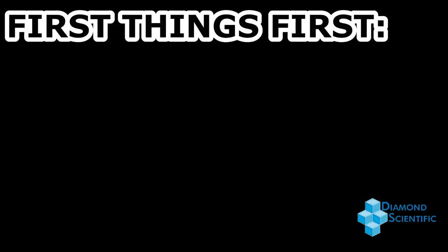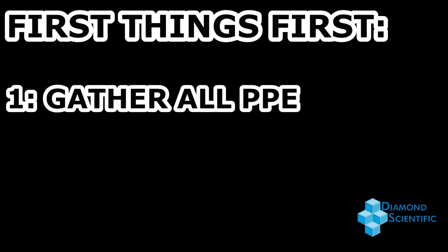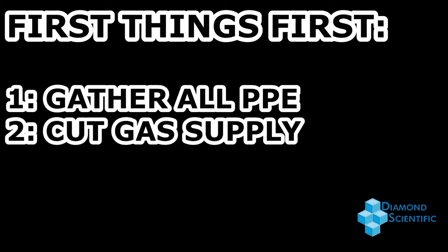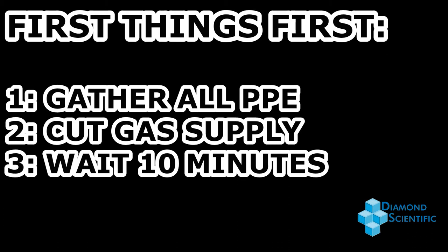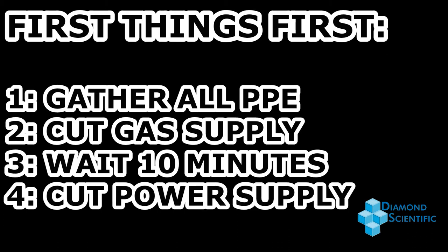First, whenever performing maintenance on the SWG-100, gather all appropriate personal protective equipment. Then you'll want to cut off the gas supply. Allow 10 minutes for a full gas purge cycle to complete before completely cutting power to the analyzer.